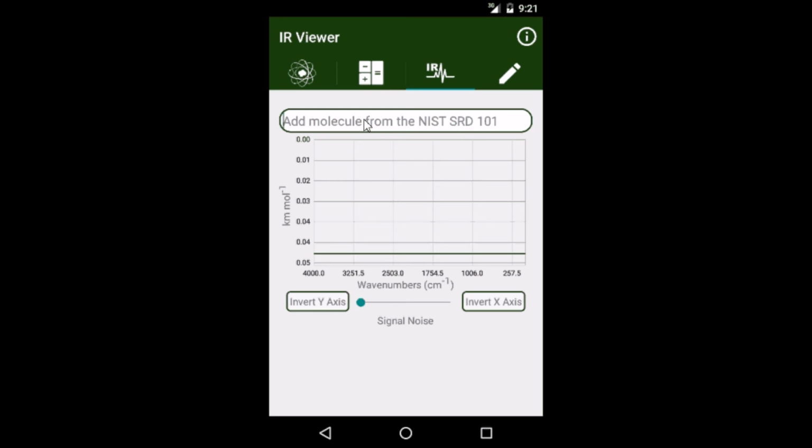For example, if a researcher is looking at an experimental spectrum for what they think is ethane, but there are several peaks in their experimental IR spectrum that don't match ethane vibrational modes, they may use LabPal to help them identify where those peaks come from.